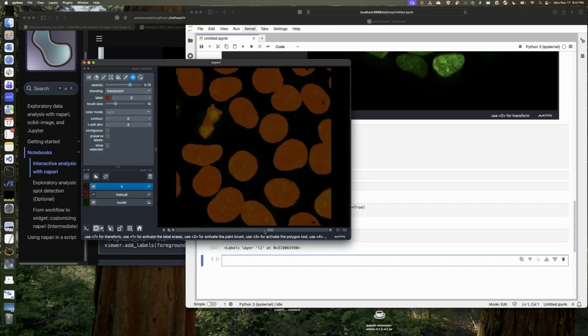And if we go, we can take a look. But notice there are some holes, so there are some imperfections here. But overall, we don't see any of that noise. And again, we can compare.